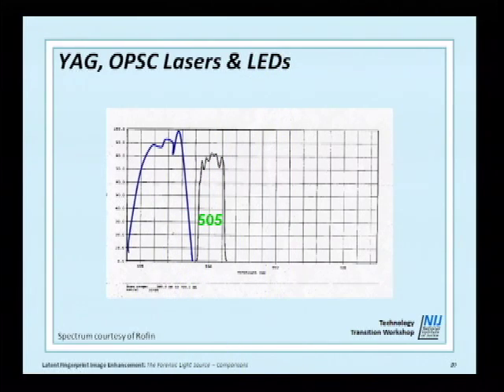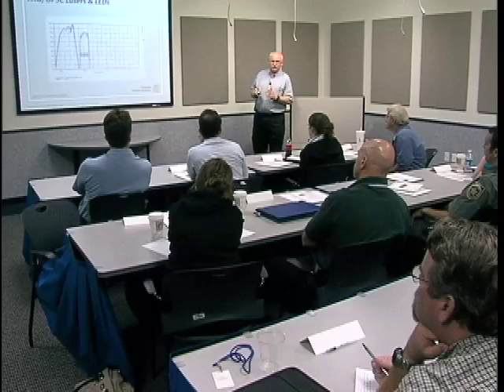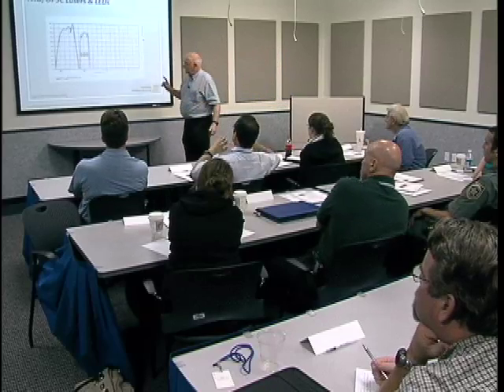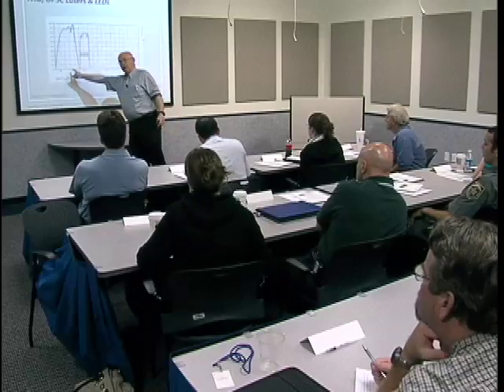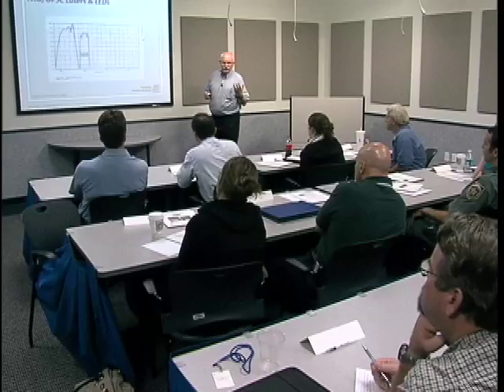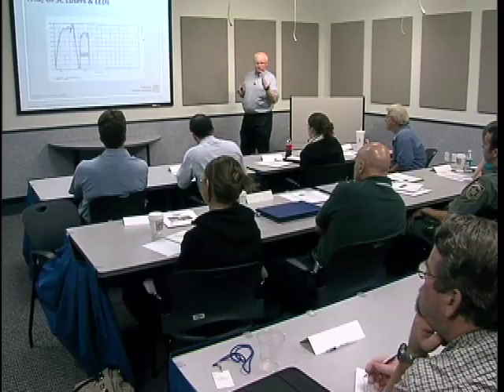And that is approximately the output of the 450, or what they call the CS filter, the crime scene filter. Now there are differences between different manufacturers. Their filters are going to have different transmission properties, not going to be exactly the same, but they made the CS filter one third of the visible spectrum approximately to make it nice and bright. It's all blue light, but it goes pretty much from 400 to 500.